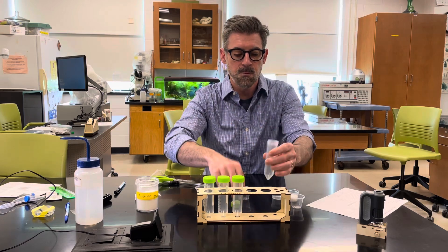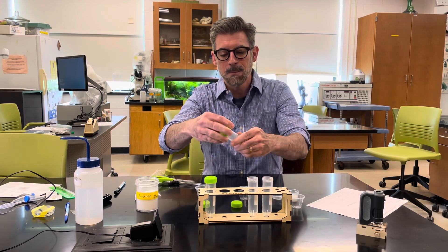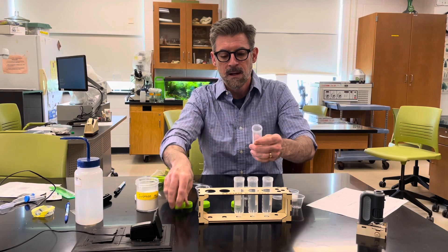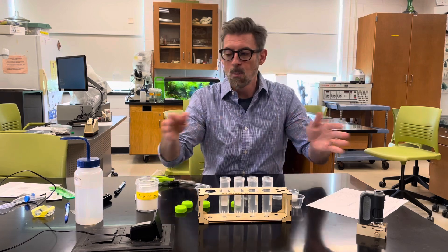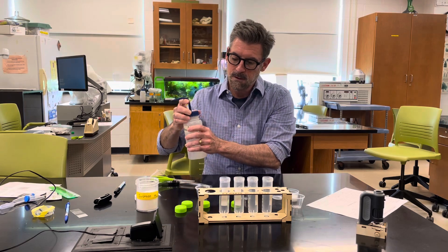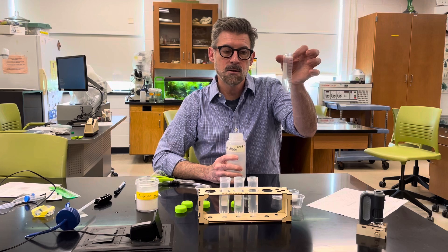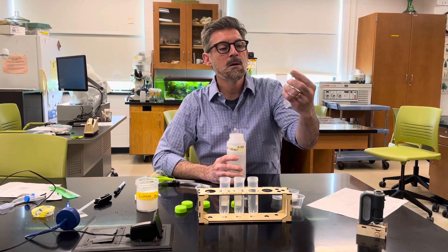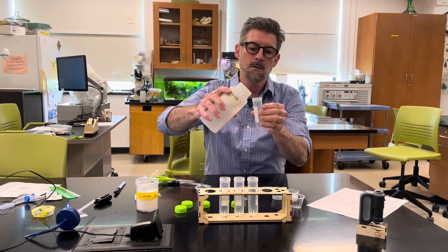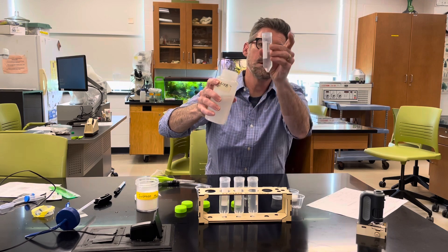I recommend getting spring water — since you're using water in so many different experiments in the class, getting a big jug is probably the cheapest option. In this experiment, you're going to have graduated tubes in your kit. Add water up to the 40 milliliter mark. I'm pouring the water in and making sure it's at 40.